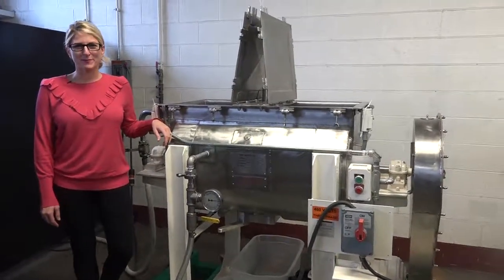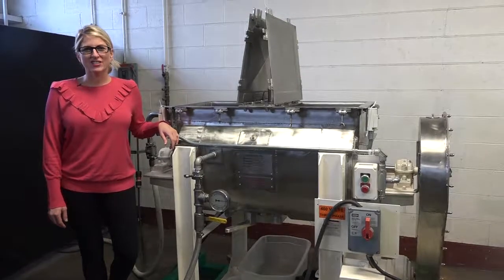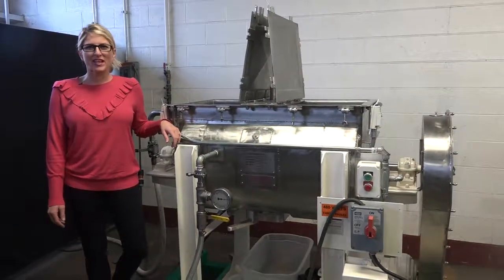Hi, I'm Katie with The Frame Group. Today we're cycling your JHD Jacketed Ribbon Blender with Liquid Injection System.